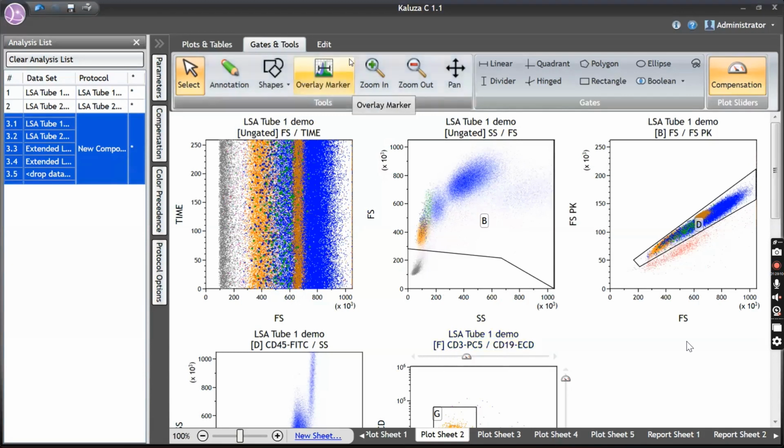Sir, what is the role of CD25 in subset analysis? CD25, correct? Yes, sir. See, CD25, as I said, for T regulatory, it is useful. CD4 positive T cells, when it is CD25 positive and FOXP3 positive, it is a T regulatory cell. Second, CD25 is also an activation marker like HLA-DR in T cells. So they also check for CD25. That is again one more advantage. Any other doubts?